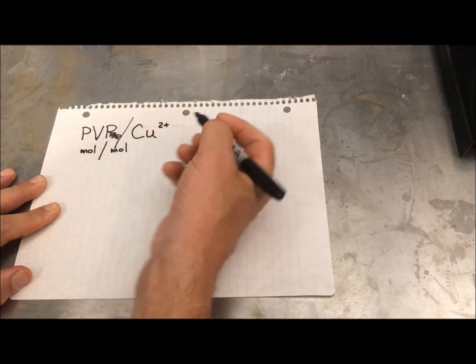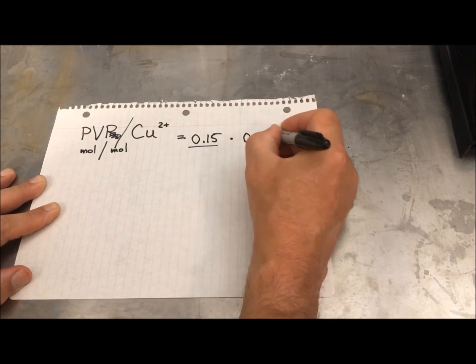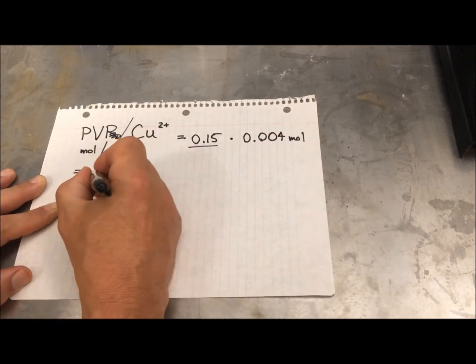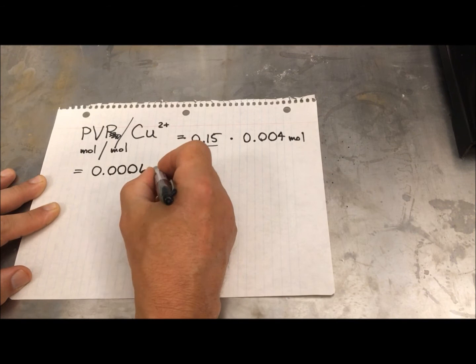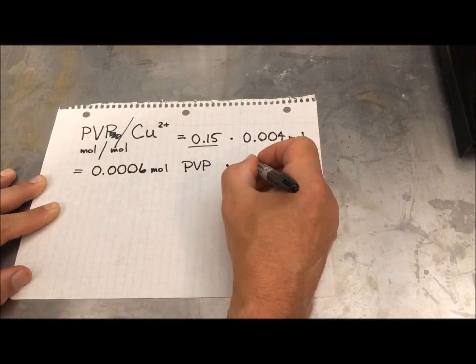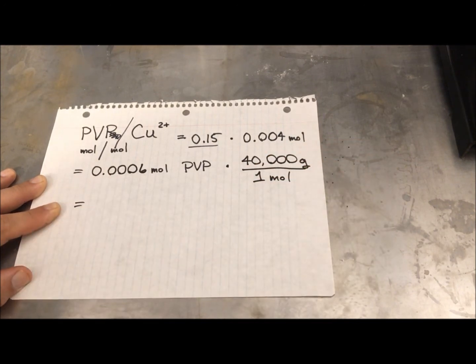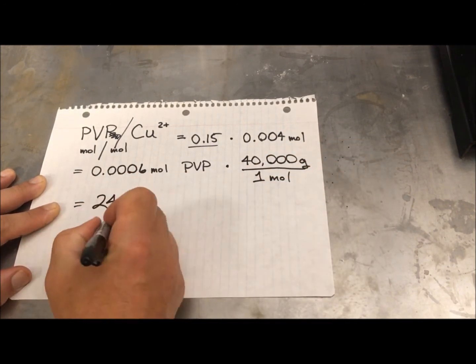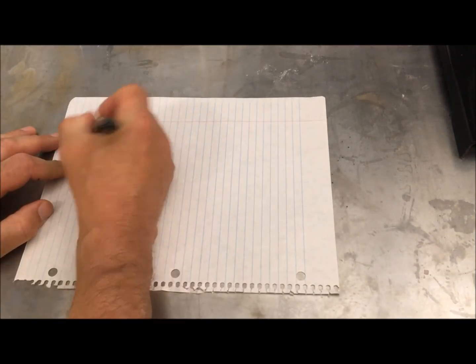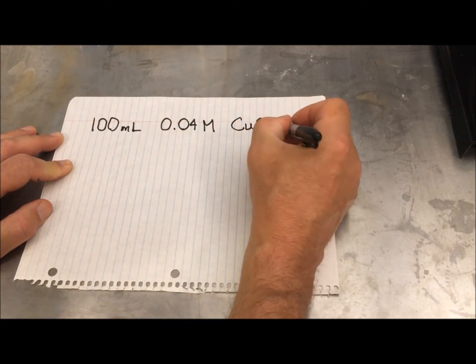You do the same thing with the capping agent. These ranged from less than 1 up to about a 9 to 1 ratio. The higher the ratio of the capping agent, the smaller the particles are. And with the reducing agent, the ascorbic acid, the smaller the ratio there also gives smaller particles.